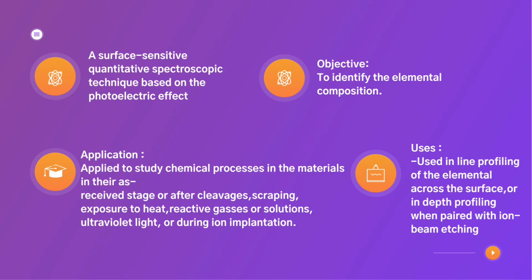X-ray photoelectric spectroscopy is a surface-sensitive quantitative spectroscopy technique based on the photoelectric effect. The objective is to identify the elemental composition.